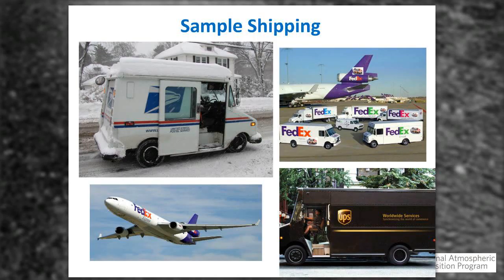And as Jeff alluded to, various federal agencies have preferred contracts with either FedEx or UPS or even the U.S. Mail. And so use your preferred contract shipper. If you have any questions or concerns about returning your sample, please feel free to contact us. But basically, your operating agency will specify the most cost-effective means to get samples to us. Just a note, used supplies can take the lowest and cheapest way to get back to us. Those are fine.